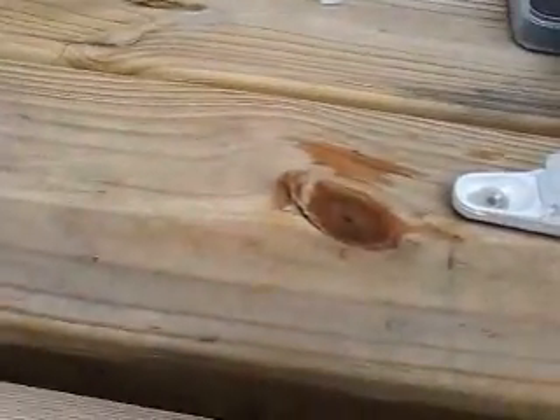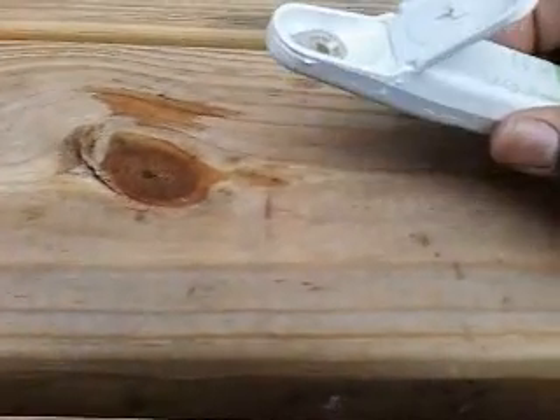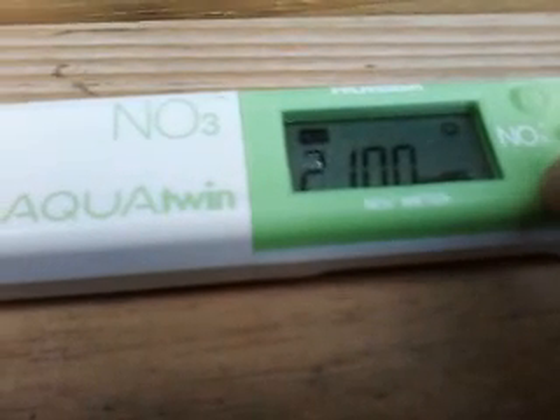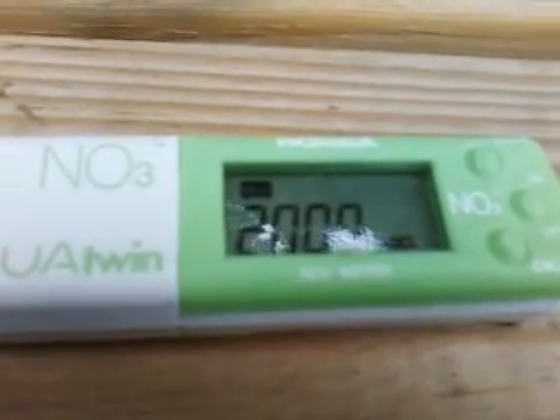Rinse it nicely. Discard it. Now add 2000 ppm in there. It's reading 2100 — that's a little bit too much, so let's hit CAL, then confirm it. Now 2000 is ready.